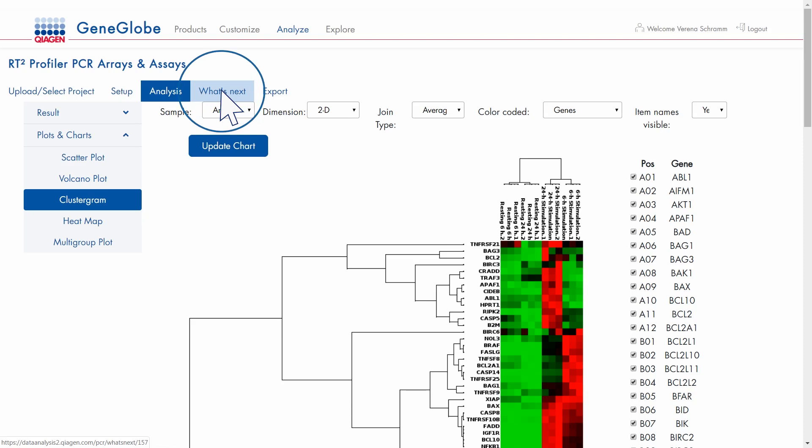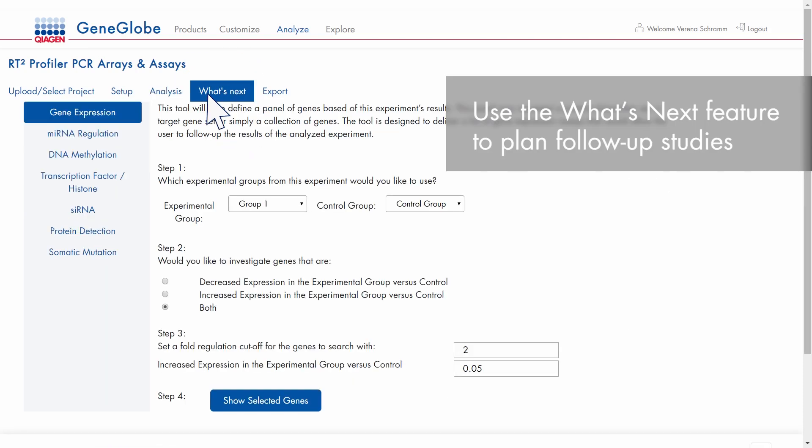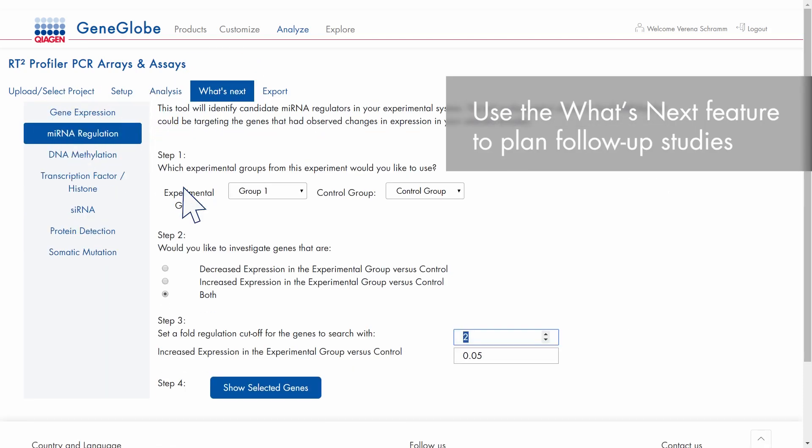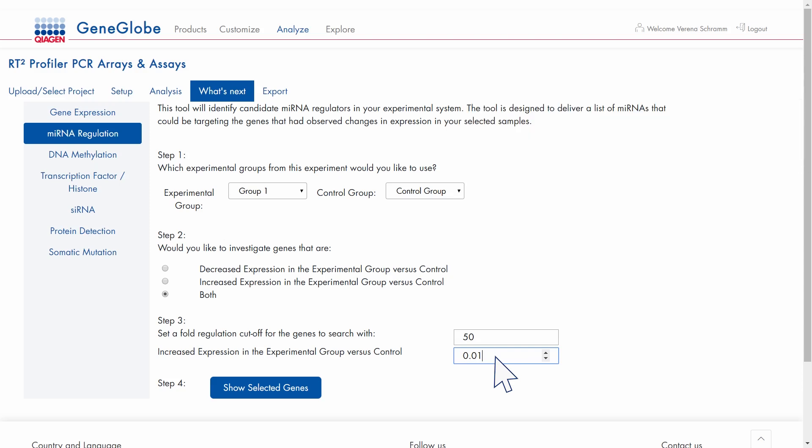And use the What's Next feature to plan follow-up studies and find other assays for analyzing your new targets of interest.